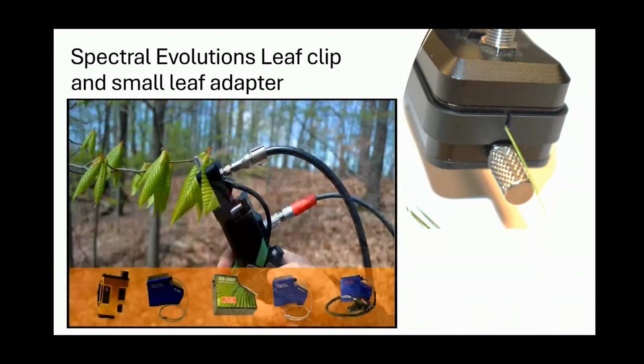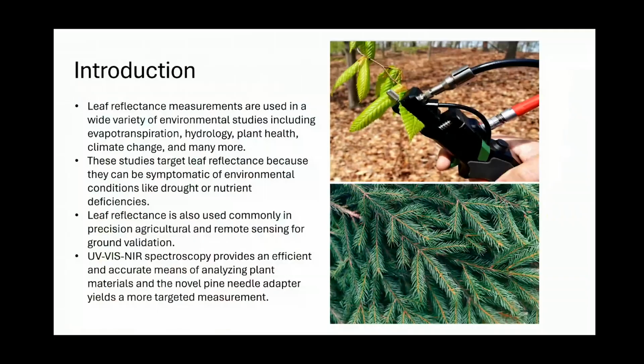Now the first thing I'm going to do is introduce leaf reflectance measurements and leaf spectroscopy as a whole. Leaf reflectance plays a critical role in studies on evapotranspiration, hydrology, plant health, climate change, and many more studies.